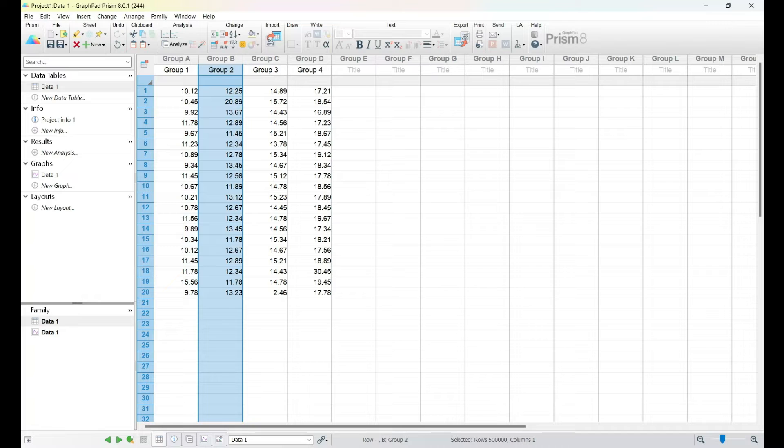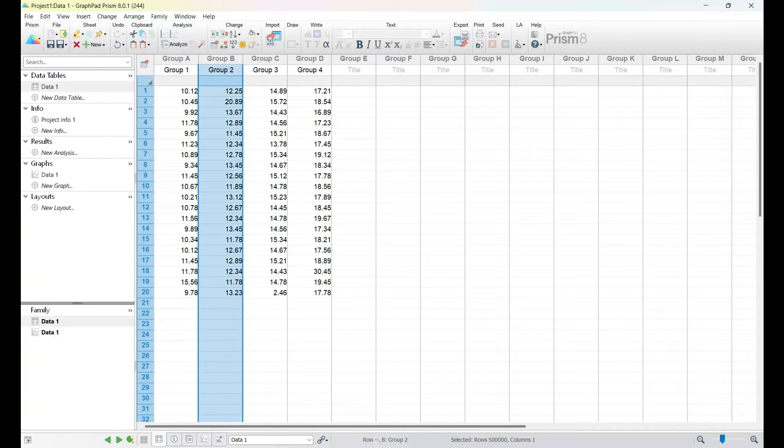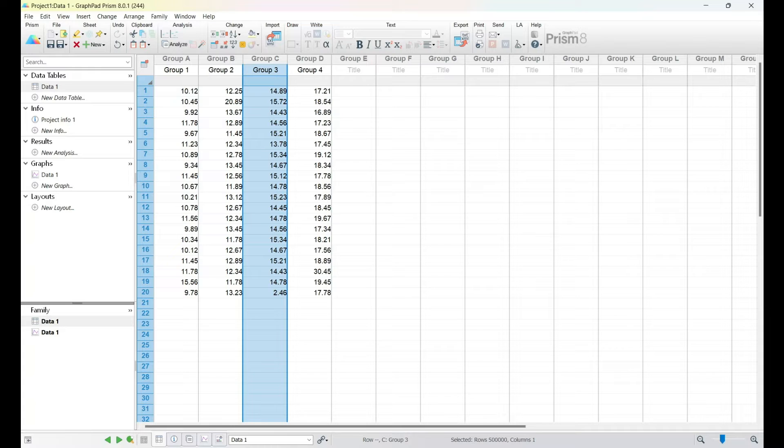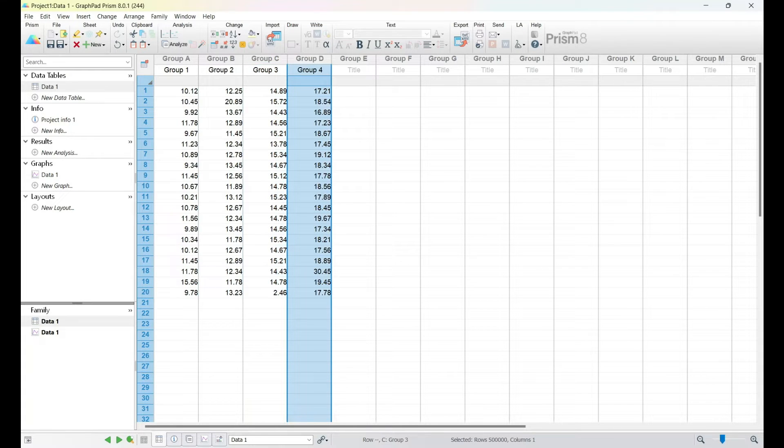Ensure your data is arranged in columns, with each column representing a different group. Once you've entered your data, GraphPad Prism provides a clear overview, allowing you to double-check for any typos or inconsistencies. These 20 data points in each group represent a hypothetical scenario.